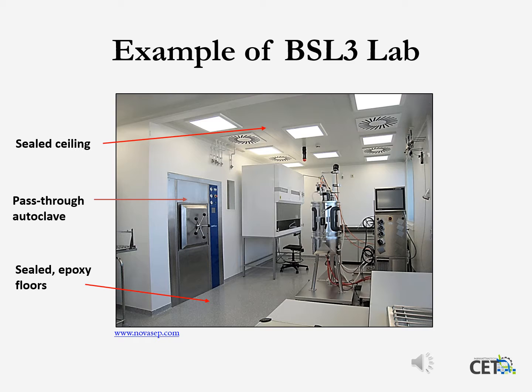Those mechanical features used in BSL 3 labs include: they must be in an isolated zone of the building. These labs must be isolated. They must have a restricted entry. That means biometrics or the pin pad. They must have inward flow of air. That means the air is always coming into the room. The air in the room cannot leave the room and get out into the building. That's one facet of the control of aerosols.